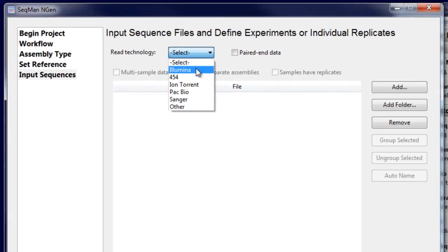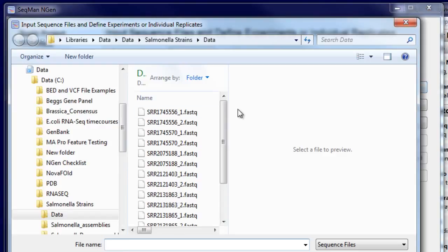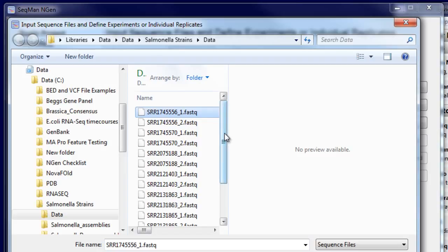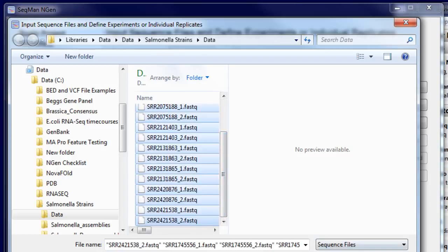Next, select your read technology and load your sequence data. Here, I'm loading FASTQ files for eight different salmonella strains.